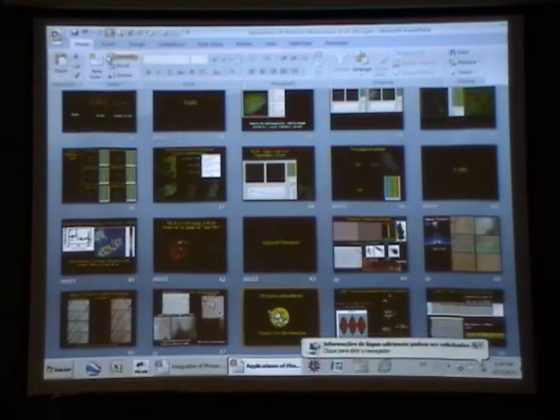But at this point, we work with kind of slow processes. What I pretty much decided to do is to look at the embryos developing, so I can see all the transformations that the stem cells can do to differentiate, and why they cannot come back. This is a slow process, so we can follow it. If you do not use autofocus, you're going to start to have problems because the focus drifts through time. Temperature changes a lot during the night and the day, but it's already built in. It should be working fine. It did work fine for at least 4 hours with this.